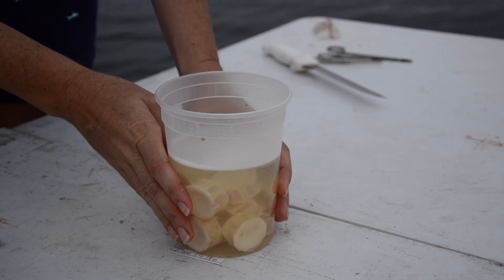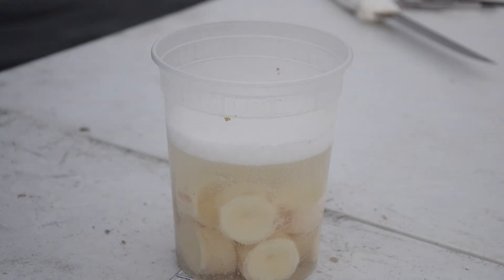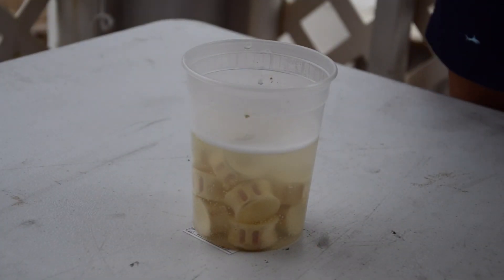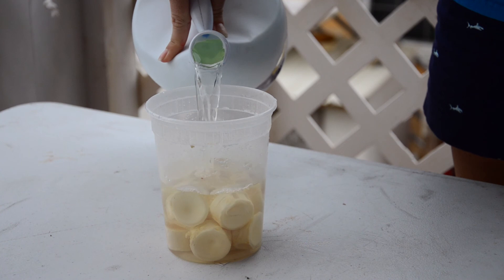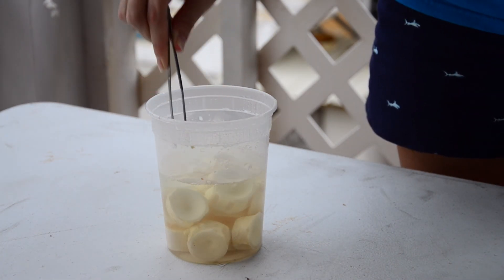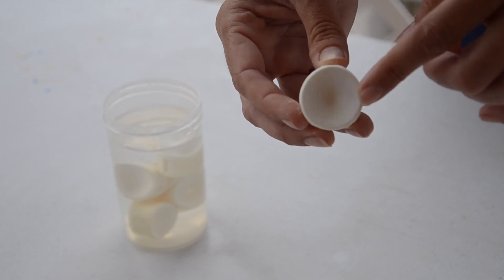After about 30 minutes, if the container has gone cold that means the chemical reaction has stopped. It's been about ten minutes and you can see a lot of foam and bubbles, so I'll give it a stir. After 30 minutes the bleach is somewhat clear, no longer bubbling, and cool to the touch — the reaction has stopped. For very small vertebrae a second application of bleach may not be necessary. For stingrays and young-of-the-year sharks, keep a close eye even on the first application because it can eat away at the entire vertebral centra. Clean vertebrae will be completely white with no yellow spots of tissue on any of the edges.